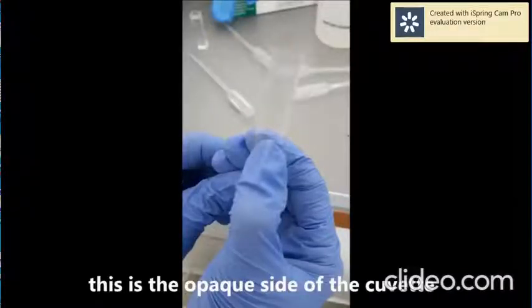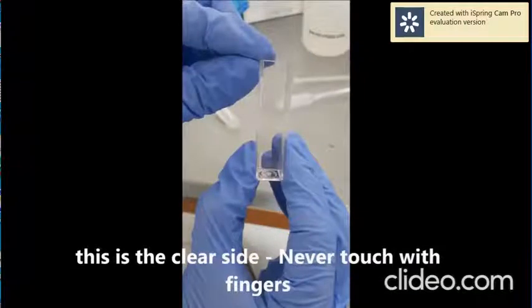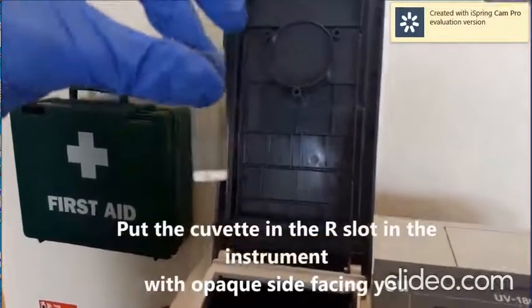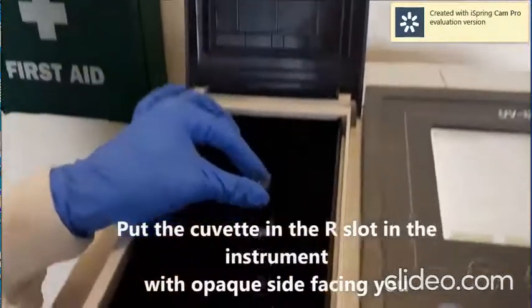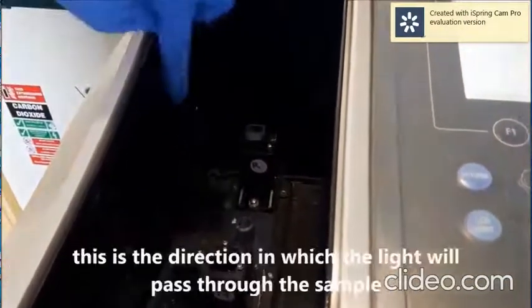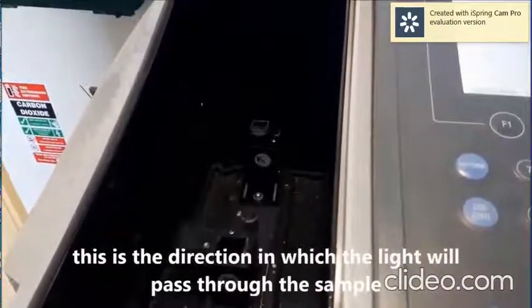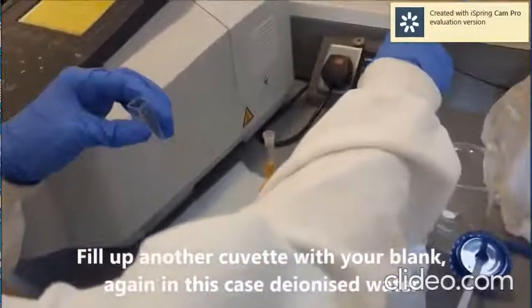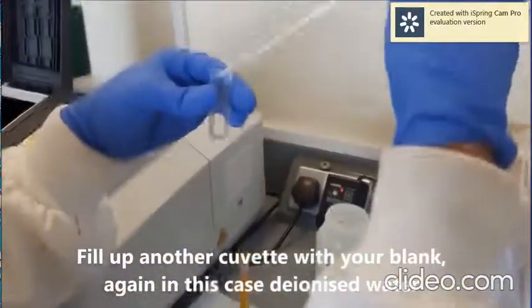We have to put the transparent side in a manner where the light can pass. Now this is the reference portion, and here we later add our sample, so that the system is ready for further reading. Now both the cuvettes are full with the blank. This blank we are now going to place inside the machine.